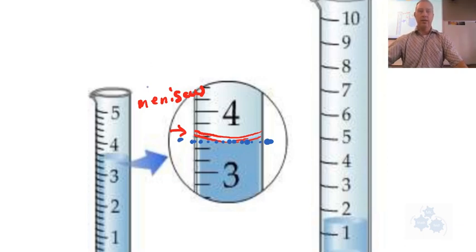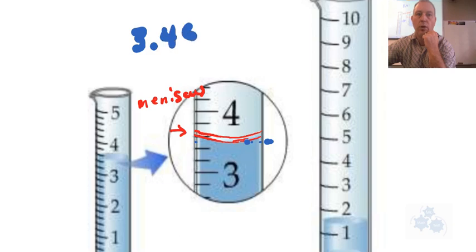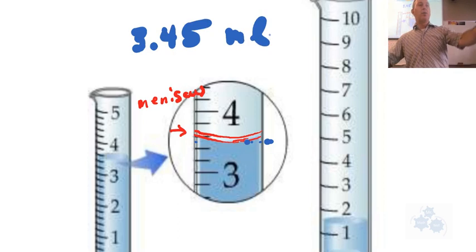So this measurement, if you were looking at this measurement here, you would say this would be, and I'm going to say this, three points, now this is 2468. So this is 3.4, and you can go one more number. So maybe a 3.45. And that would be, looks like milliliters. So that one that's going around is 54. The top layer is at about 55. The bottom is at 54. So just so you know.